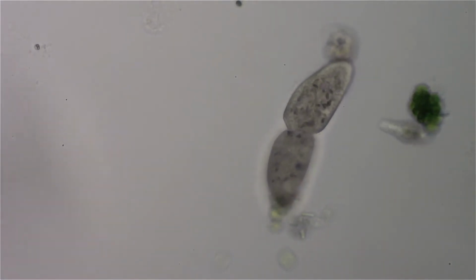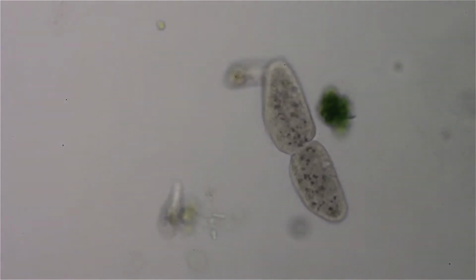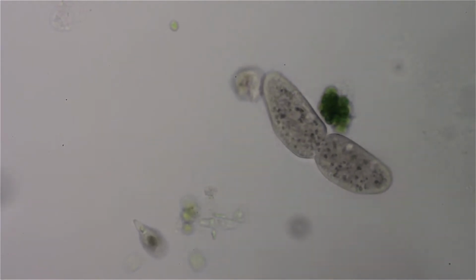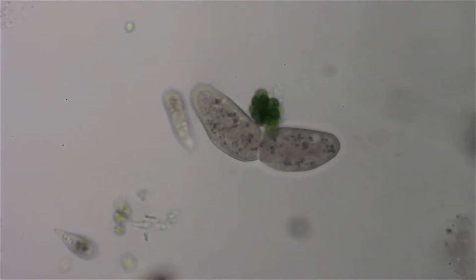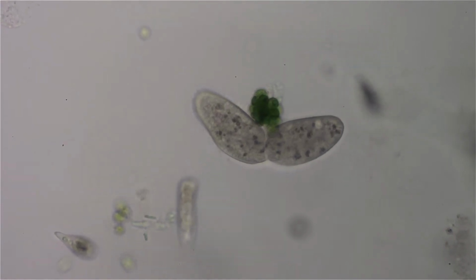It turns out they're more or less like a euglenoid. They do have an eye spot, which you'll see later on in this video. The Paramecia seems to be taking an interest. He's going to tickle his buddy there.